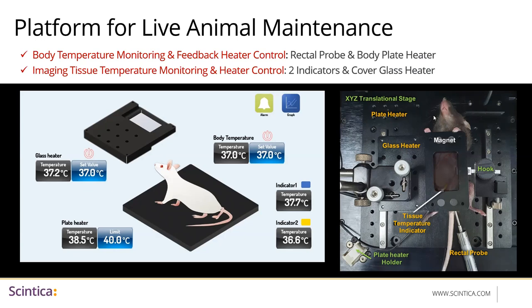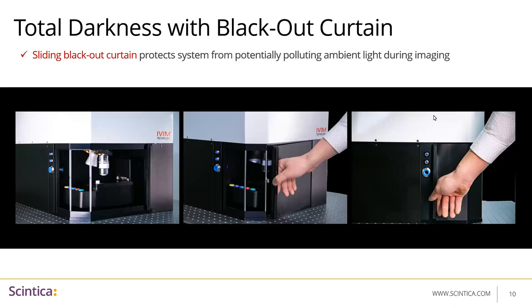You need to keep in mind that if you're imaging a number of animals, you need to change the coverslip when switching from one animal to another to prevent contamination. Another cool feature of the system is its design as a closed box with a sliding blackout door, which protects your experimental sample from ambient light. Unlike other microscopes requiring dark rooms with floor-to-ceiling curtains, this one can be placed in any room with any lighting source — no need to worry about light penetrating your chamber.